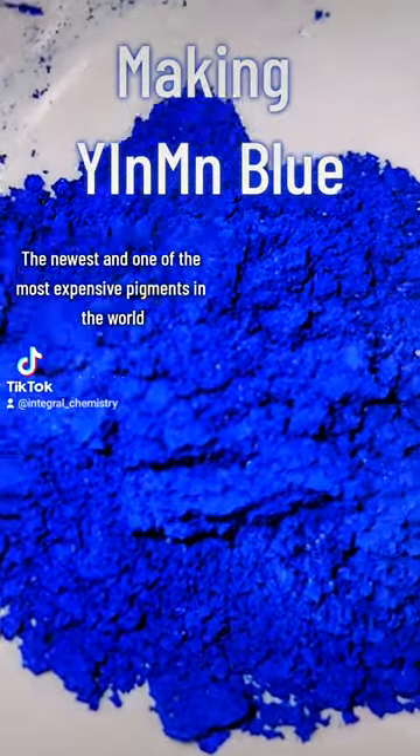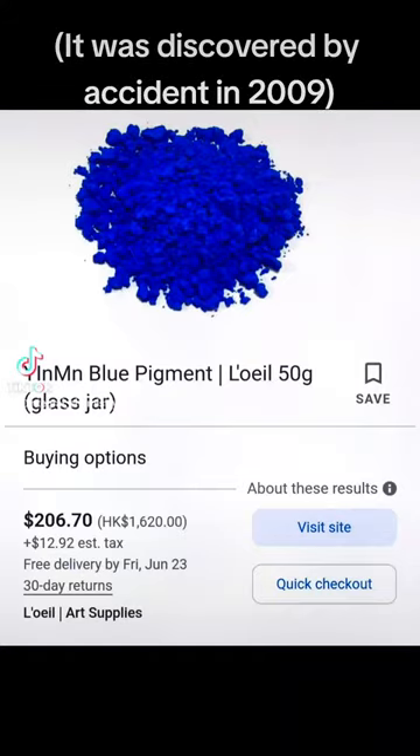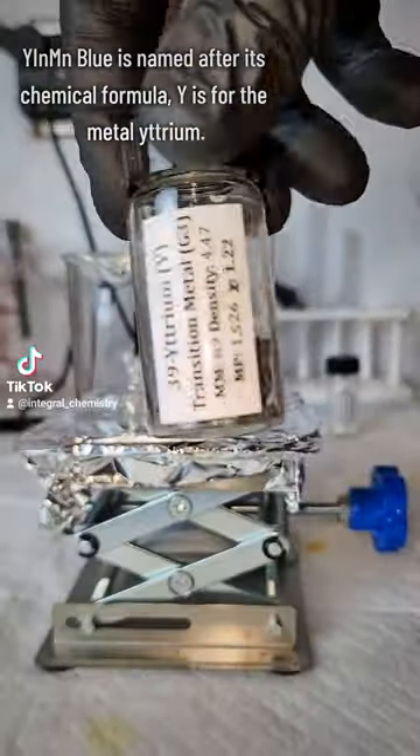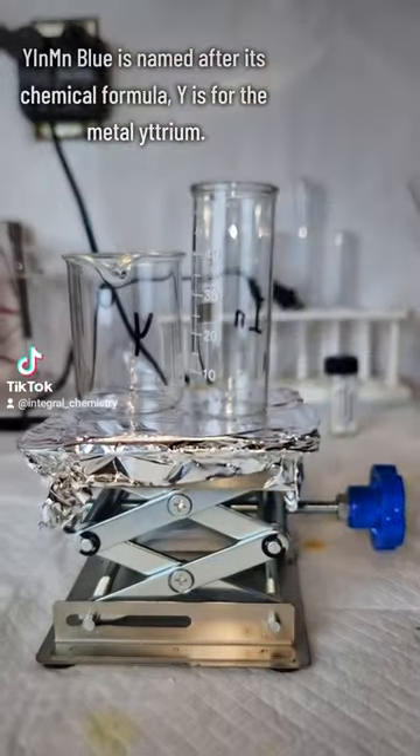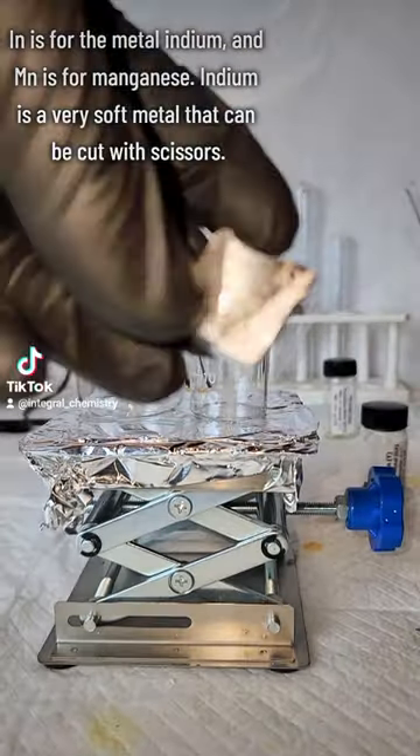Today I'm going to make YIN-MN Blue, which is the newest and one of the most expensive pigments in the world. It was discovered accidentally in 2009, and it's named after its chemical formula. Y is for yttrium, IN is for the metal indium, and MN is for manganese.